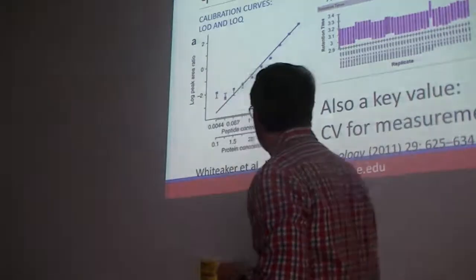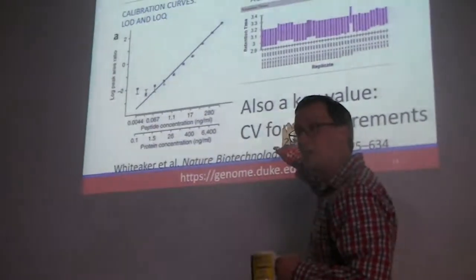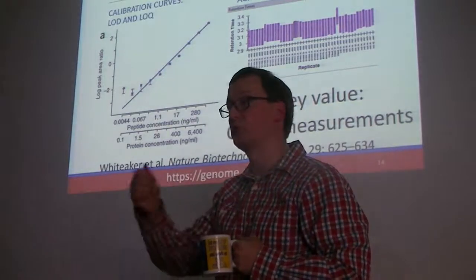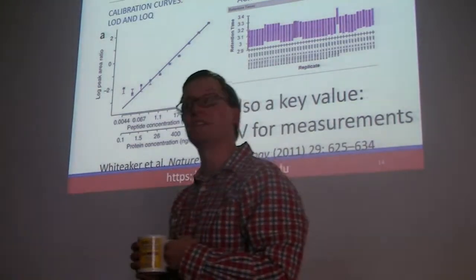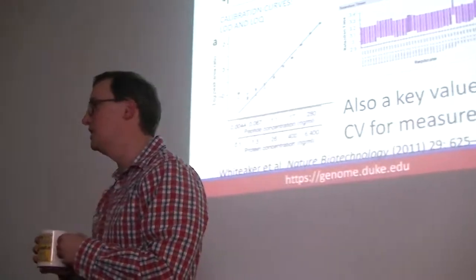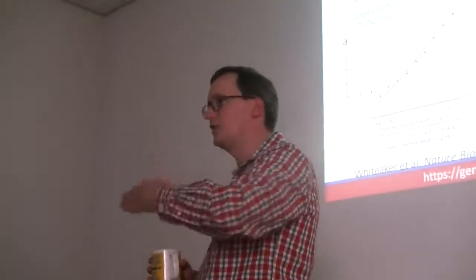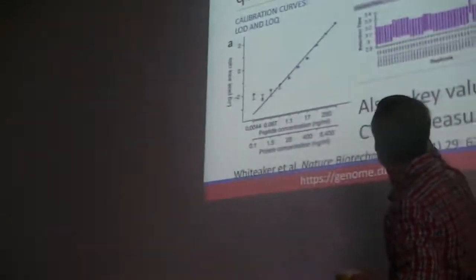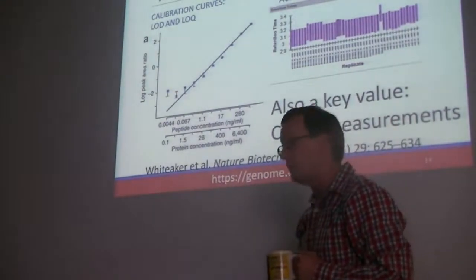So frequently we find that there's a degree of variability in when a particular analyte comes off of a particular column. Maybe you run that sample 10 times and you see a few seconds variation each time on the retention times. So being able to compare those across replicates is actually quite valuable.